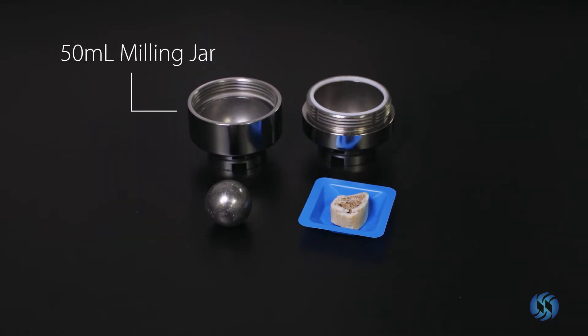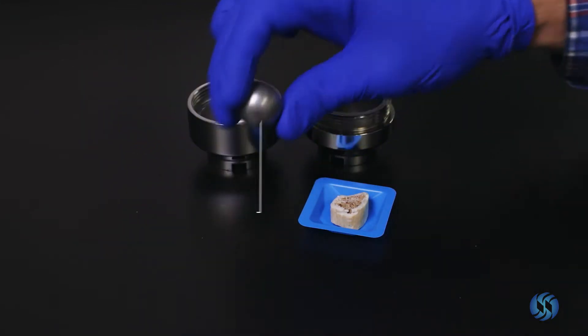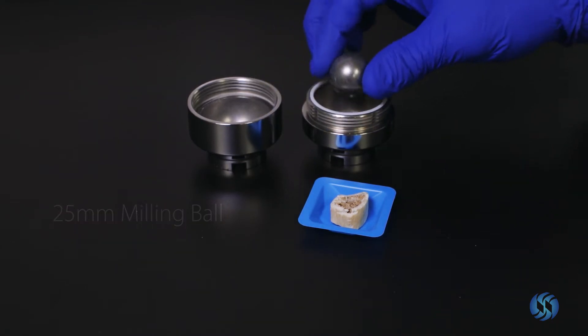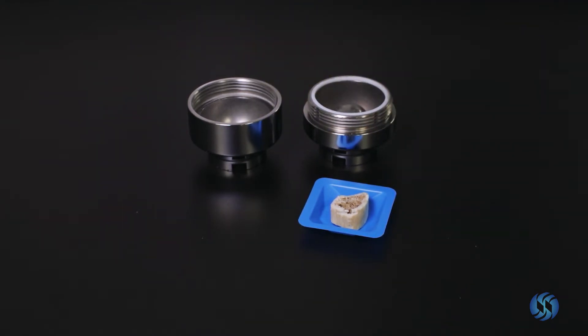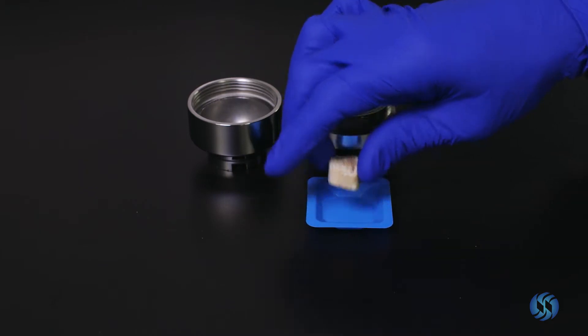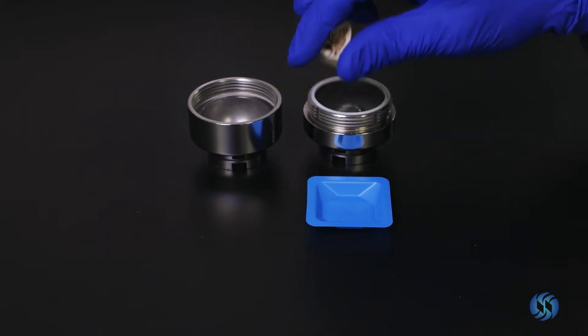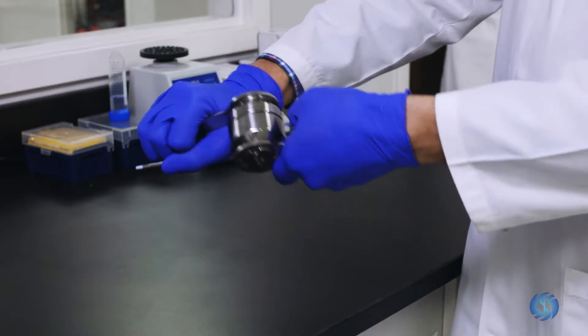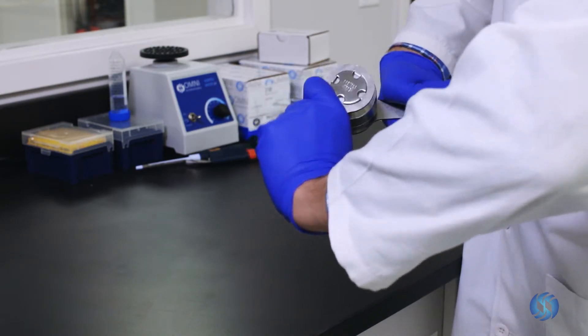Prepare a 50 milliliter stainless steel milling jar with a 25 millimeter milling ball. Place your bone sample into the milling jar. Ensure that the milling jar is tightly sealed before proceeding.